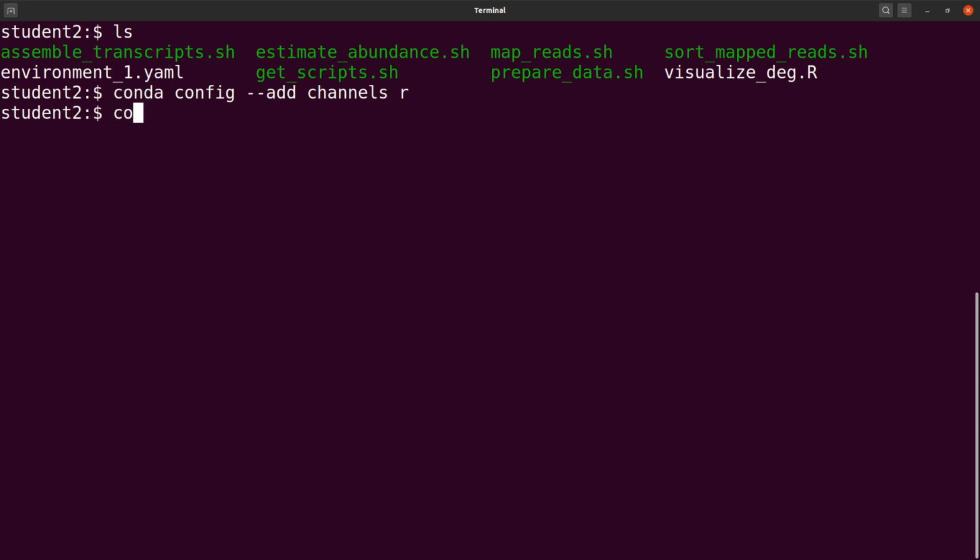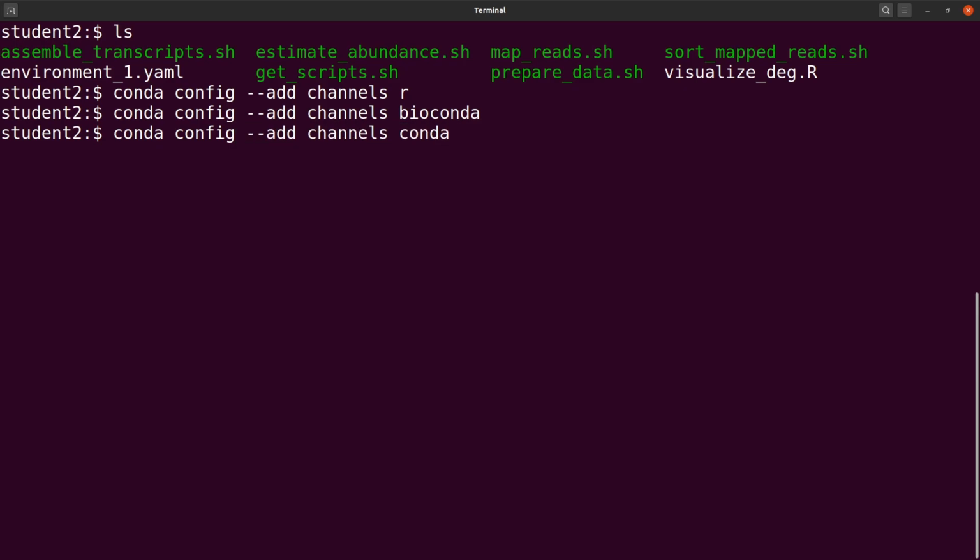Let's add a second channel: conda config add channels bioconda. Let's add a third one. The same command, but this time we add conda-forge. Perfect. So now we have all the channels added, so we are ready to roll.